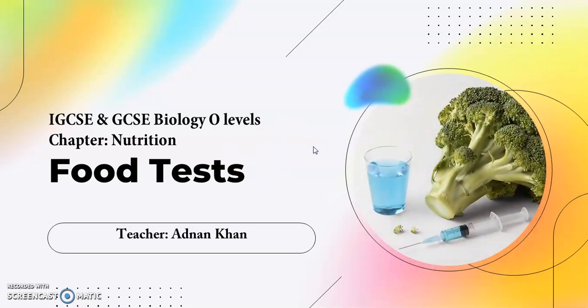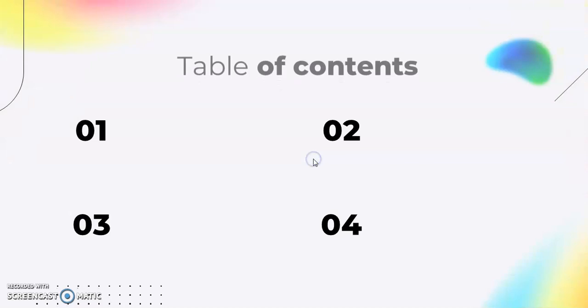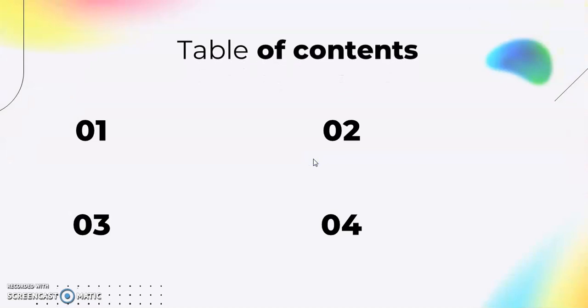As you know, food samples may contain different sorts of nutrients, and upon them we apply different food tests to find out their quantity or their presence. Now in this video I'll be discussing 4 types of food tests.